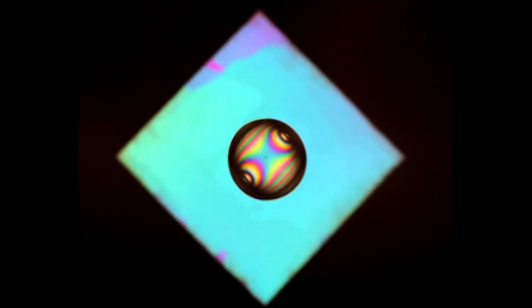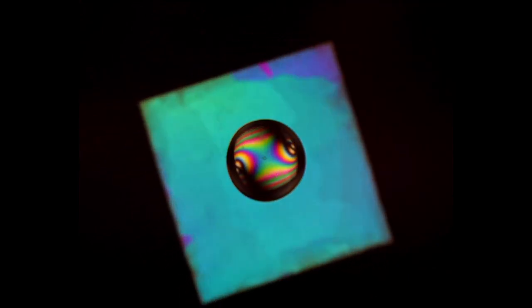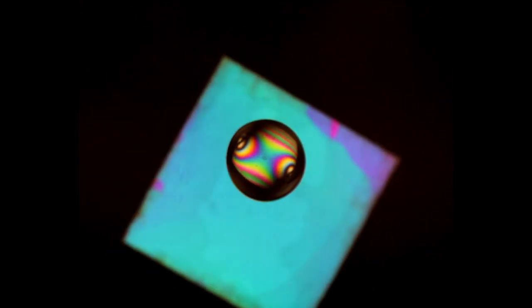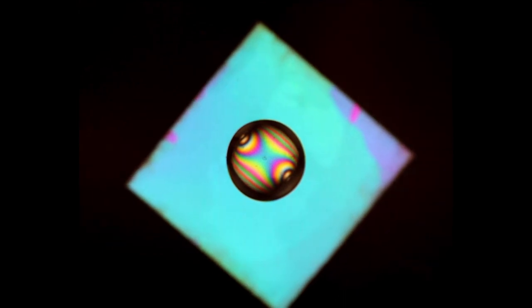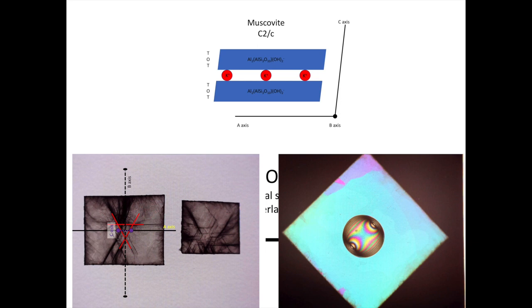Let's also take a look at the almost-BXa figure and how it behaves as we rotate the muscovite crystal. The behavior of biaxial interference figures is much more interesting than for uniaxial minerals. As we rotate the specimen, pay attention to the movement of the isogyres. Being able to generate a BXa interference figure lets us know the material is biaxial and that we're looking down onto either the gamma–beta or alpha–beta plane of the material.